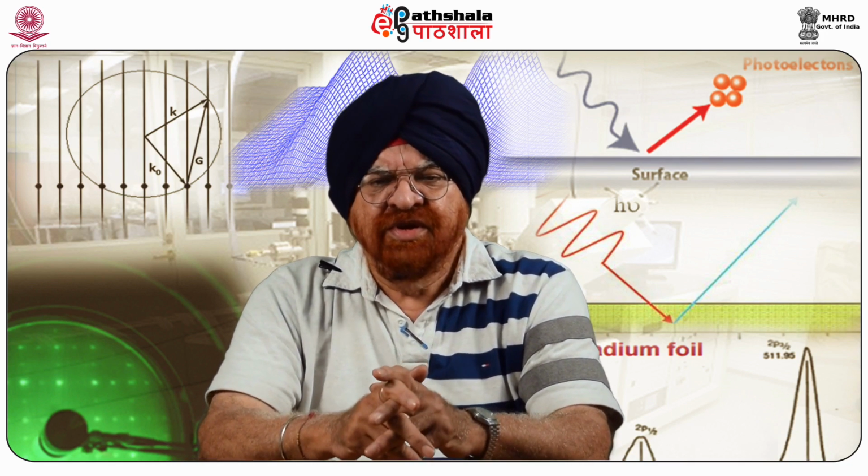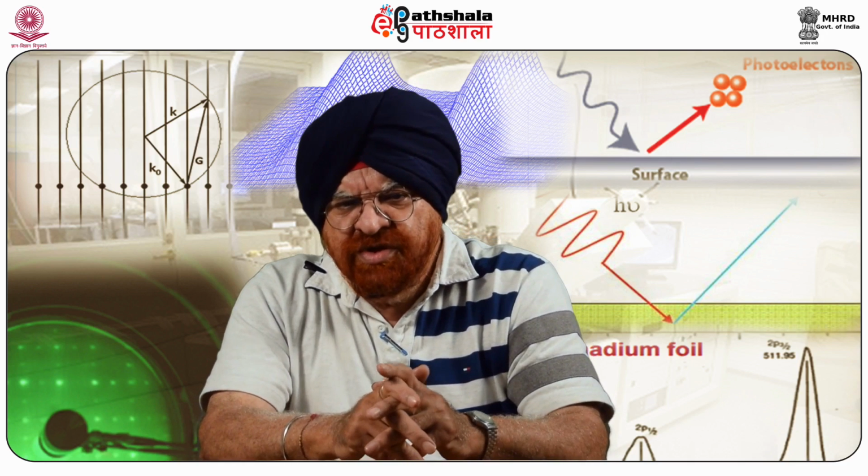Continuing with the applications, the binding energy of one or more electron states can be measured with the help of this. The density of the electronic states can be found out. The thickness of one or more of the thin layers, that is 1 to 8 nanometers, of different materials within the top 12 nanometers of the surface can be very precisely measured.